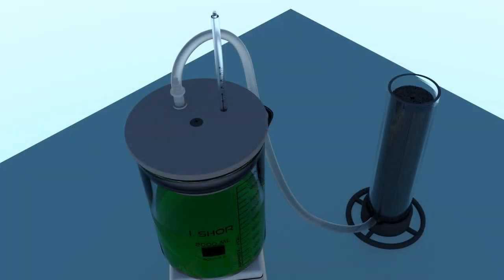The quick connects provide an easy, vapor tight, and rapid method of connecting with a fume scrubber.